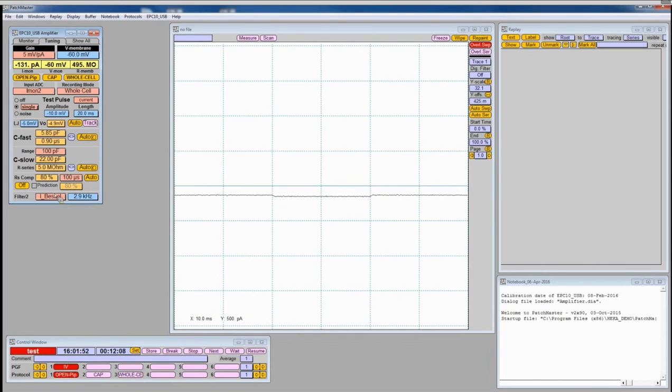Before we do that, I want to show you how to do the whole thing now with those auto buttons. To do this, I go back and basically set everything back to the beginning so that everything is like it was in the beginning when we started the whole process. So this is 0, this is 0, this was 0, this was 0.